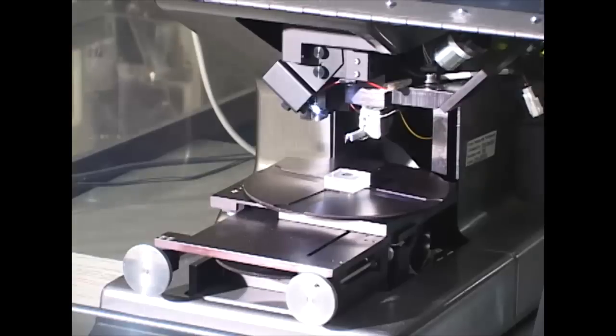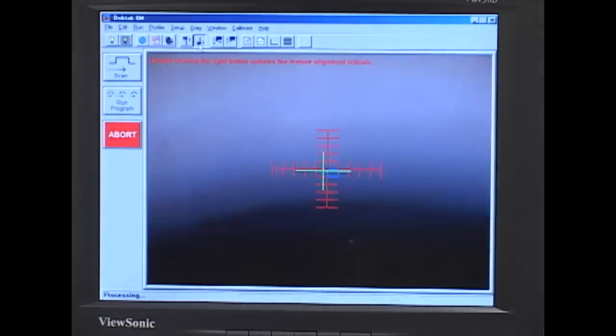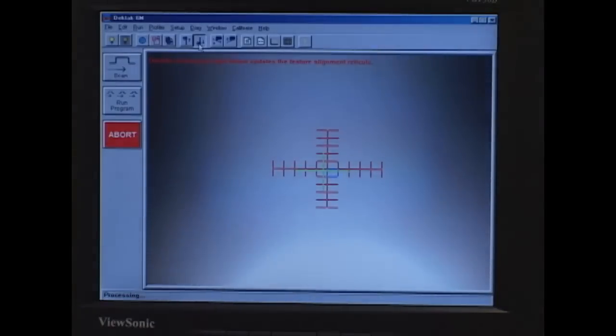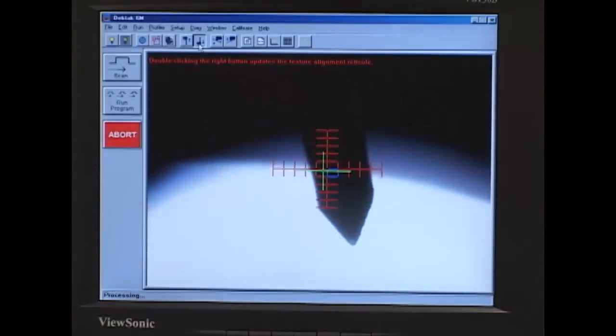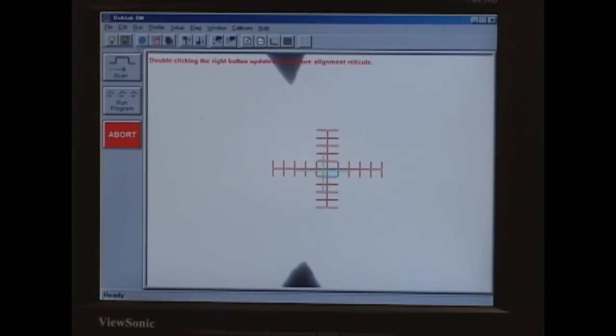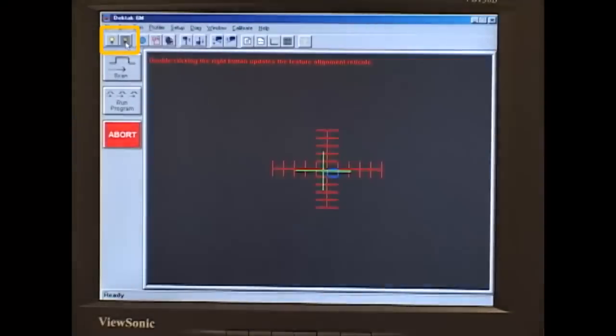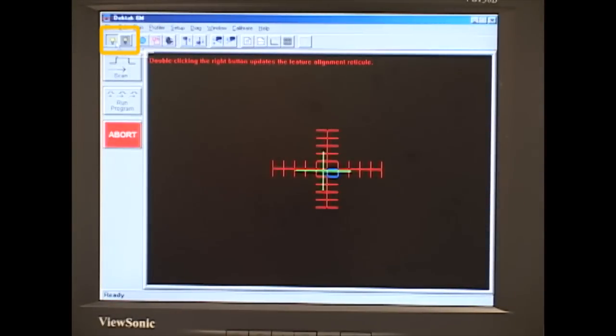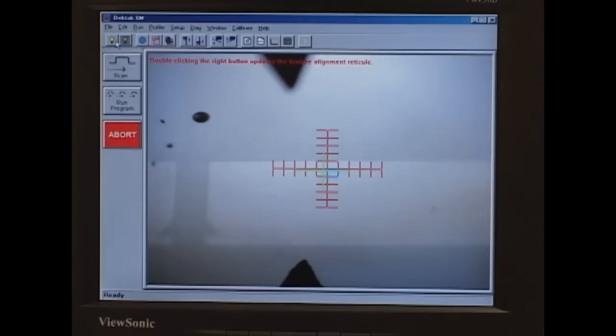And then back on the program, we'll click on this button here, which is the tower down to null position. And that will lower the stylus onto our sample. As you can see, the camera on the instrument is picking up the view of our sample and the stylus touching it. The brightness is pretty high, so we can turn it down and then bring it back up to where we can see much better.